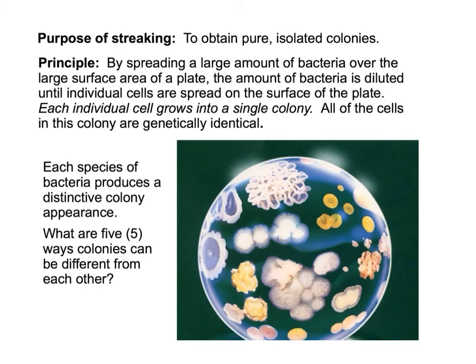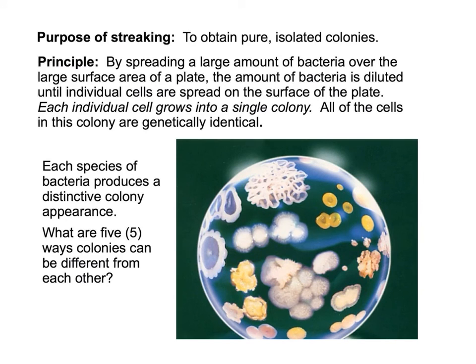Each species of bacteria produces very distinct colony appearances. As we look at this particular slide, you will notice that we have quite a few different types of bacteria present.